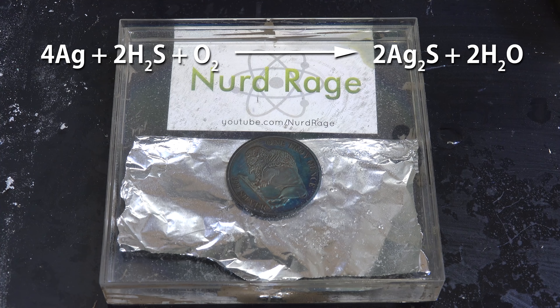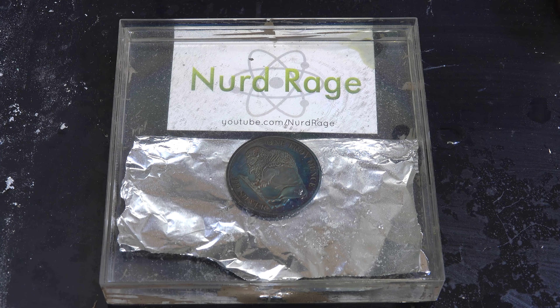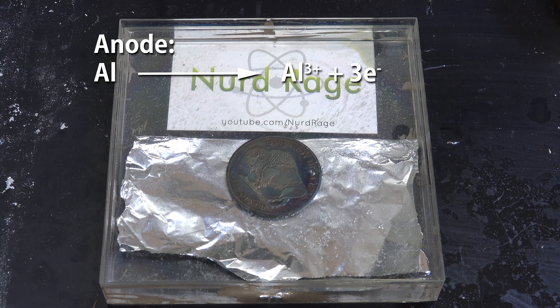And that is our restored silver coin. Let me do it again, this time with a deeply tarnished silver coin — this will take longer but it will still work. So what's happening? The color tarnish on the silver is actually silver sulfide, formed by a reaction with small amounts of hydrogen sulfide and oxygen in the air.